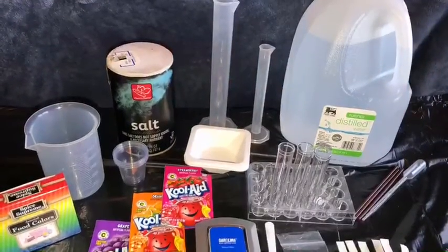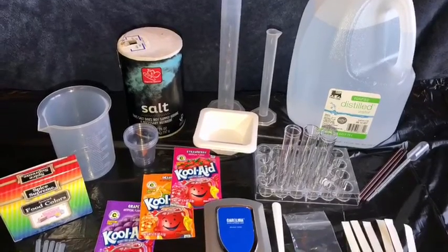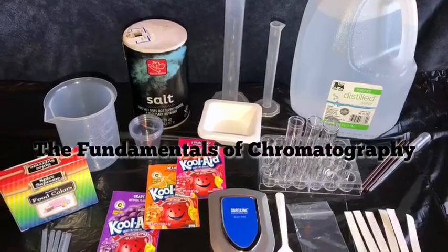Hello everyone, my name is Devan Stoeling and today I will be showcasing one of my favorite experiments from doing organic chemistry at home, the Fundamentals of Chromatography.